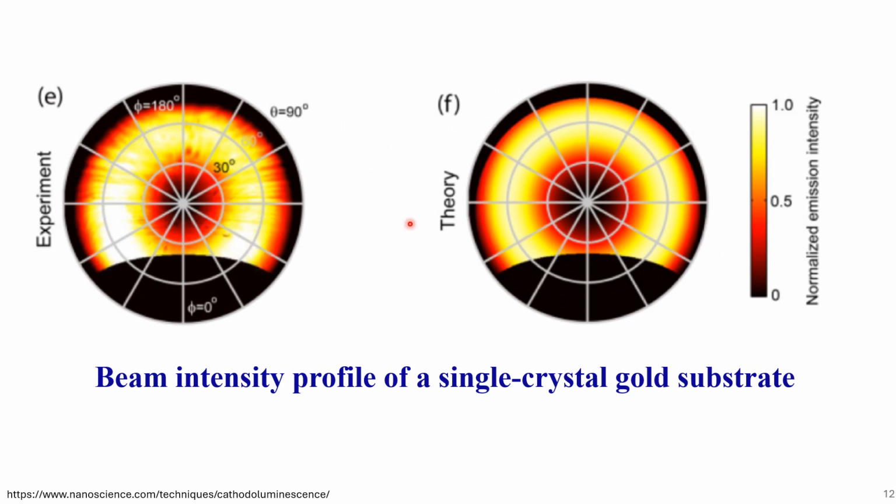In this example, the radiation was toroidal, with little CL signal perpendicular or parallel to the top surface. Every point within the profile can be directly associated with the specific emission angle in the upper angular hemisphere from which the CL is collected.